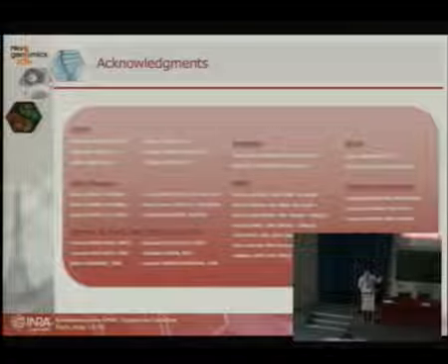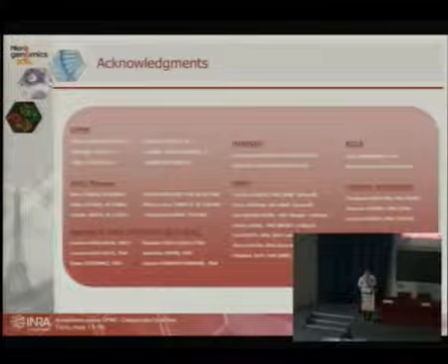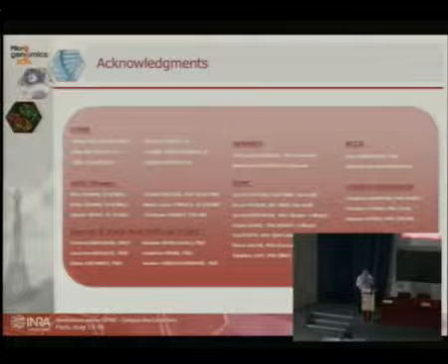Gamma deltas were gamma delta. The precursors that were not even expressing a gamma delta receptor were already expressing the genes. So I'm highly confident that we had no issues due to this. So cooling is the key. And also, don't sort for hours.